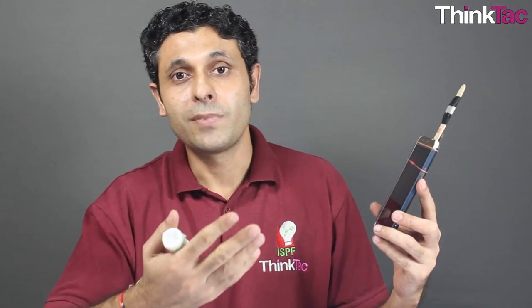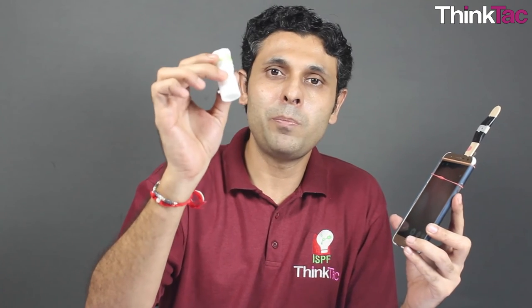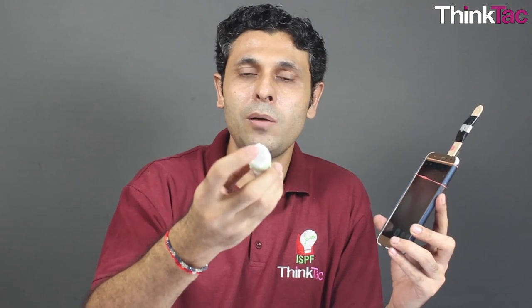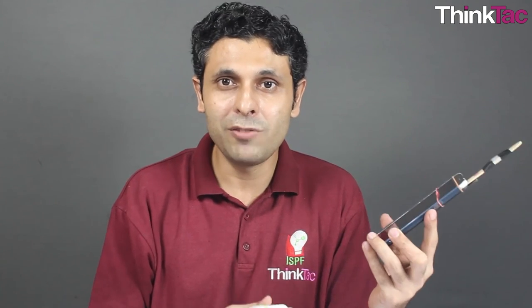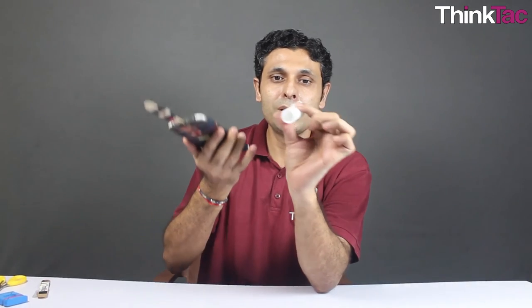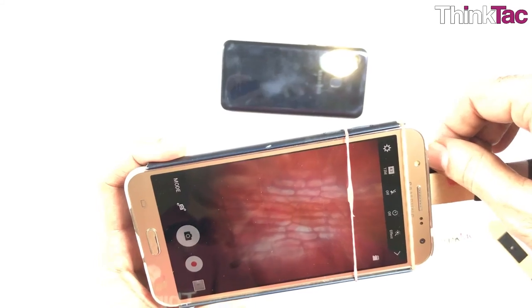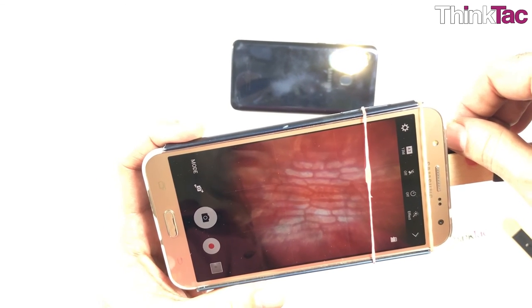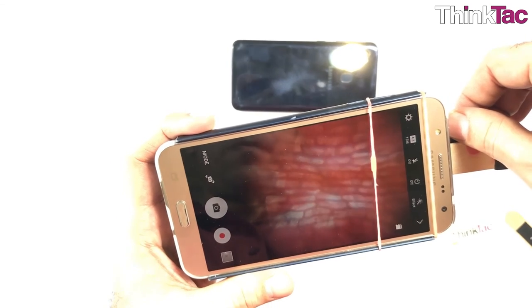Sometimes when the light source is too bright, it's not as effective. What we do here is use a simple plastic piece on which butter paper has been fixed — this helps in diffusing the light and makes it even more effective. To view, you place a mobile phone with the flashlight on below this plastic piece, and keep the microscope setup on top to get a good view.